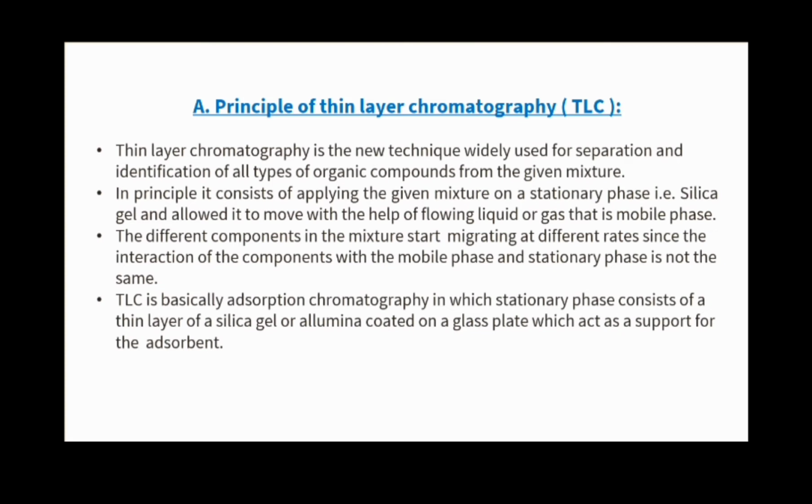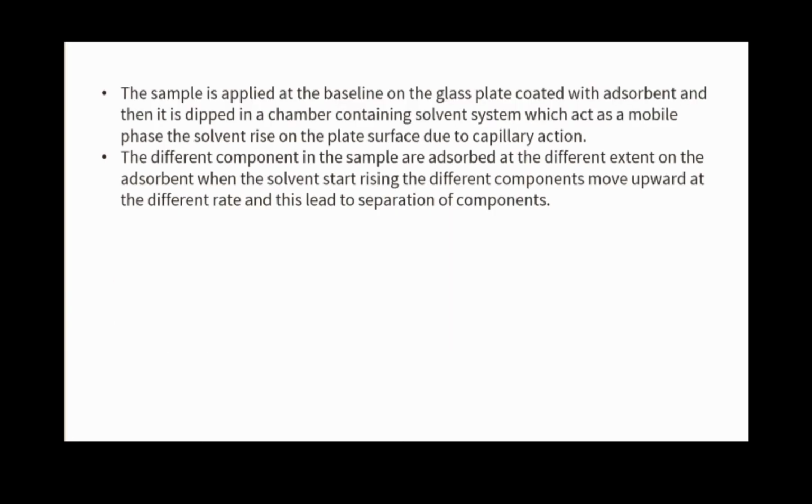TLC is basically adsorption chromatography, in which the stationary phase consists of a thin layer of silica gel or alumina coated on a glass plate, which acts as a support for the adsorbent. The sample is applied at the baseline of the glass plate coated with the adsorbent, that is silica gel, and then it is dipped in a chamber containing solvent system which acts as a mobile phase.